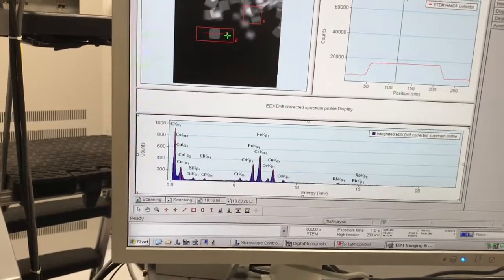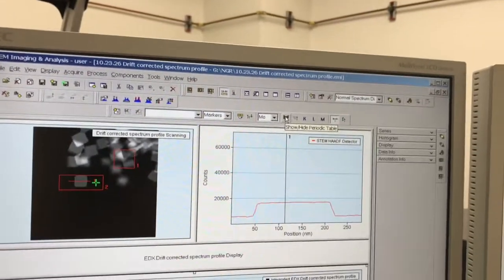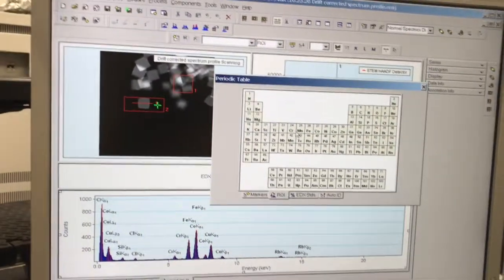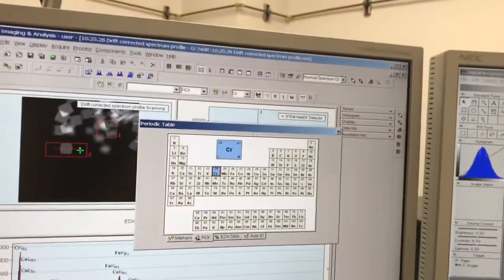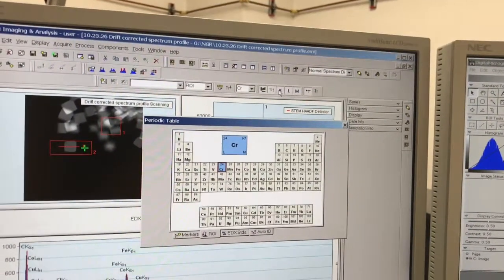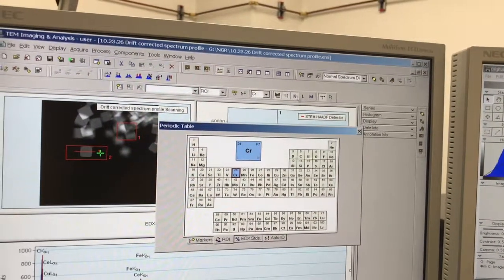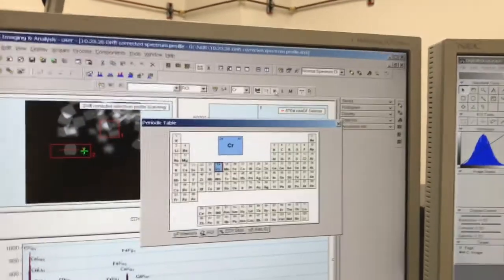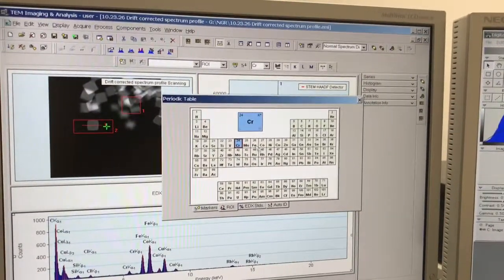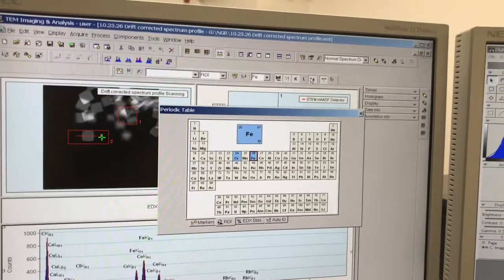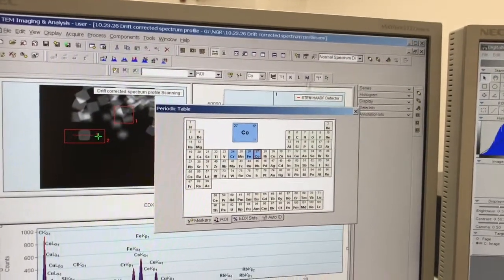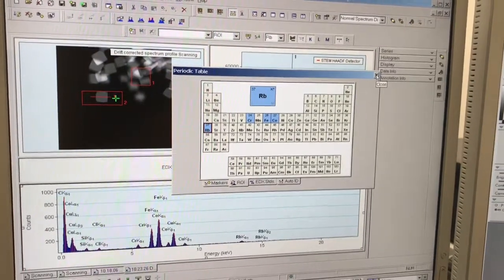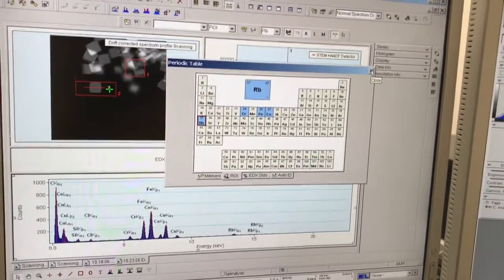I'll come up here and click on the periodic table, go to ROI. I'll start with chromium — double click to make it blue, then select which peaks. I'll deselect L and M and only use K. By default this maps only the K-alpha peak even though it just says K. Then iron — same thing. Cobalt — same thing. And finally rubidium — same thing. We've now defined what elements and what peaks we want to map.